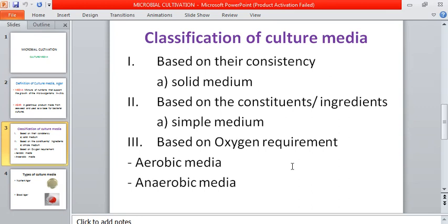And then we already discussed that for it to grow, you have to place it at a conducive, favorable temperature so that it can promote the growth of the microorganisms. We discussed the temperature to be 37 degrees, which is the best, but it differs for various types of microorganisms.